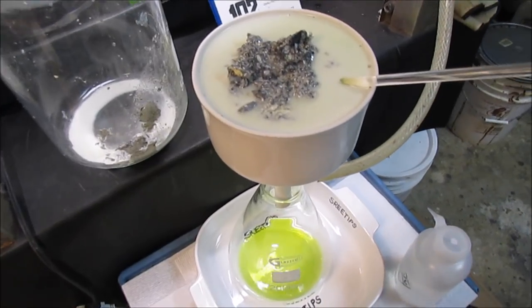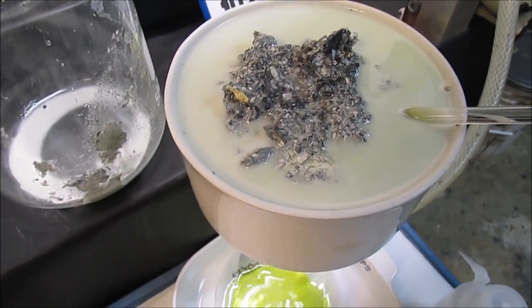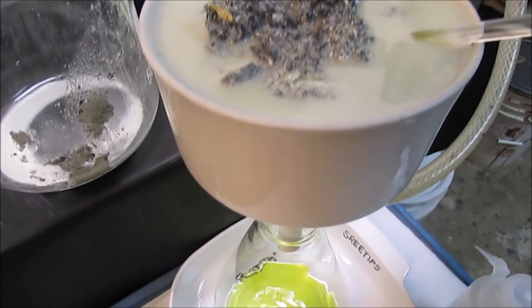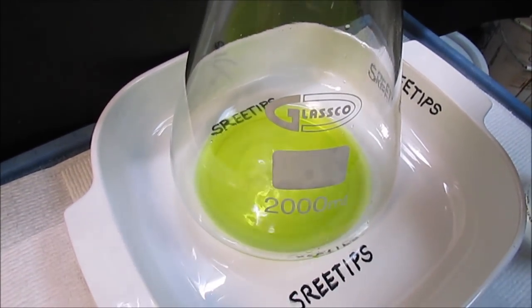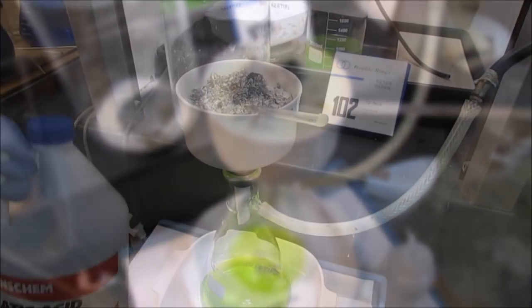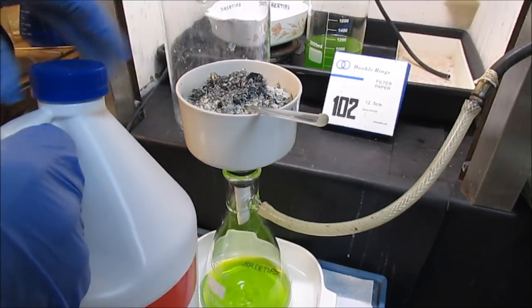This will be here filtering quite some time. This is all that particle matter that I had in the beaker. It's going to load the filter paper up, slow the filtering process way down, so it's just going to come out drips at a time here. Using a little hydrochloric acid here to rinse the beaker out.